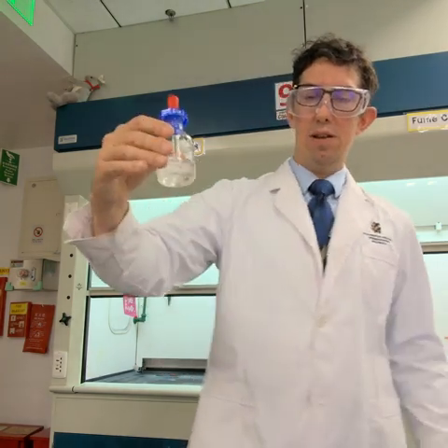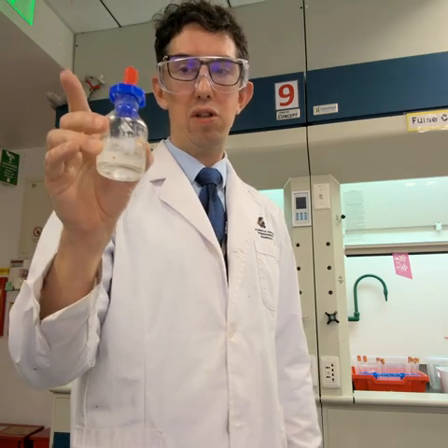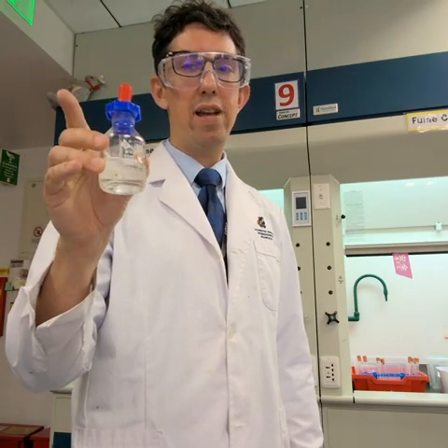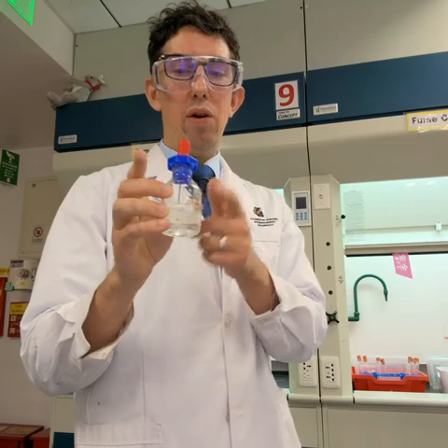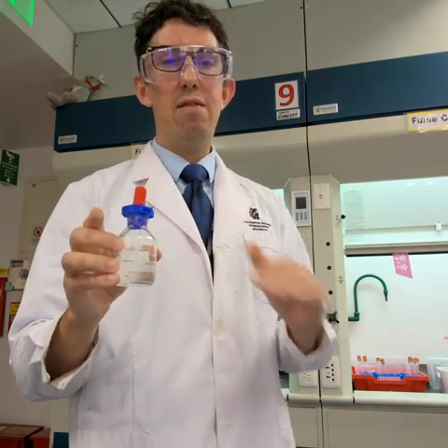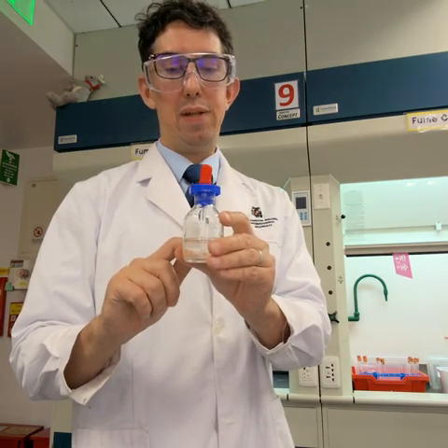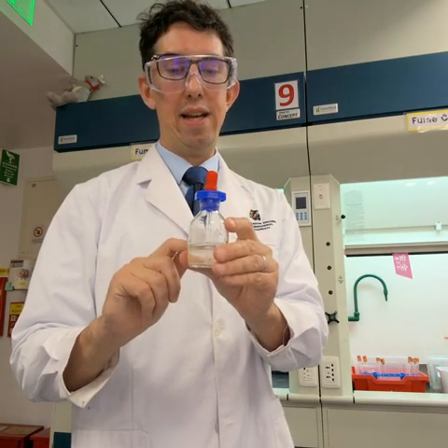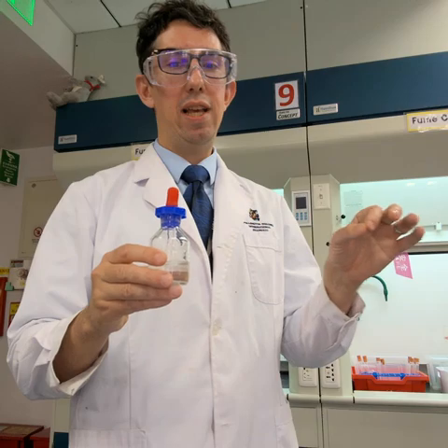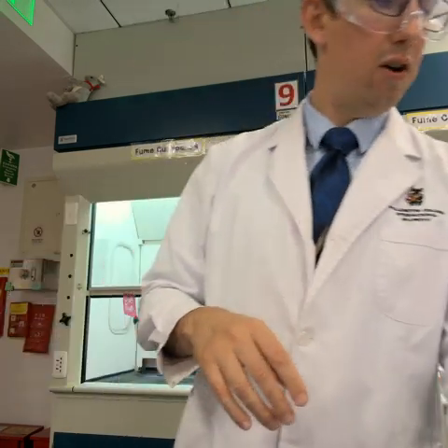So this one, well, what do you think it is? We've got no idea. It just looks like water, right? But actually this has got either chloride, bromide, or iodide in it. It also has a positive ion as well, but that is irrelevant. This one happens to be potassium something, so this is perhaps potassium chloride or potassium iodide, but the positive ion is irrelevant. The only point for the positive ion is that it must be an ion which keeps the anion soluble. That's overcomplicating it, but anyway.